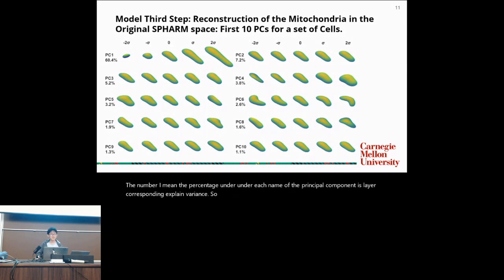From the graph, we can see noticeable variation in the reconstructed shape only for the several top principal components, like the top 5 or top 6, because they have a relatively large explained variance. For the trailing principal components, we might not be able to observe noticeable variation in their shape.